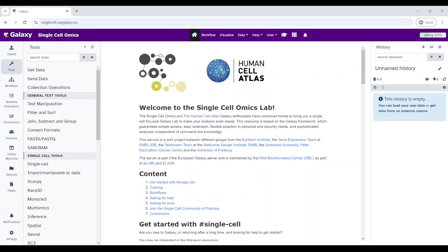Hello everyone, my name is Pawan. I am from the European Galaxy team in the tribe of Germany. In this video, I will show you a standard single cell RNA sequencing analysis on Galaxy. This analysis workflow involves some pre-processing of the quant matrix, normalization, scaling, dimensionality reduction, clustering, marker gene identification, and also cell type annotation. During the analysis, we also visualize and inspect the data throughout with some cool plots.